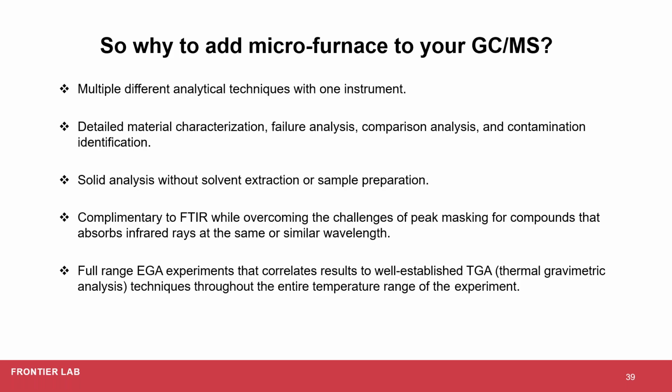So let's dive in. First question: how does the double shot discern between additives and polymers, giving separate spectra for each? If I'm understanding the question, Lauren, the question is how the additives and polymers are identified. Could you read the question one more time, please? Sure. How does the double shot discern between additives and polymers and give separate spectra for each?